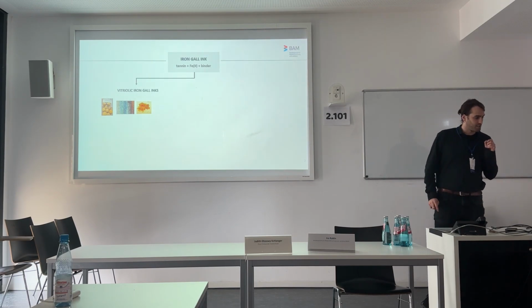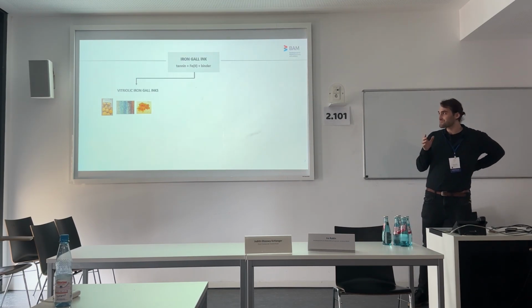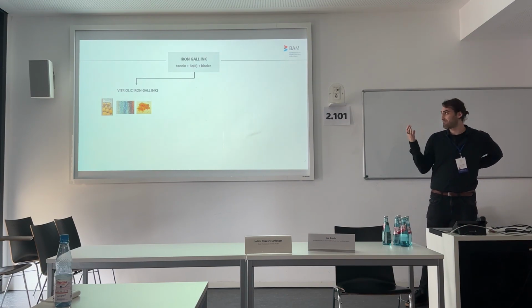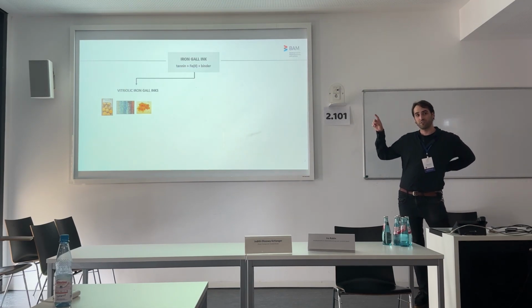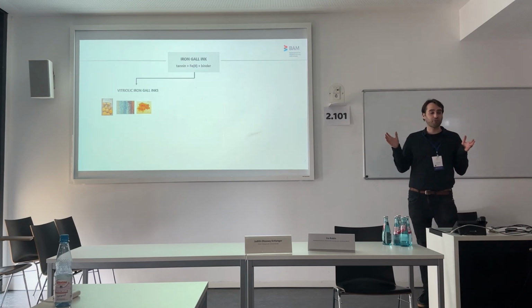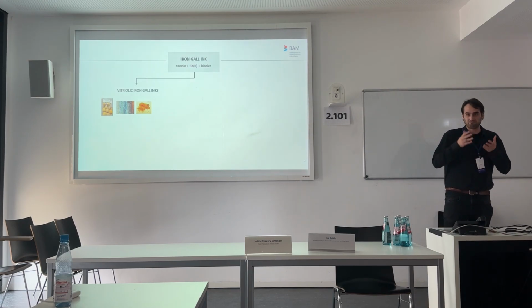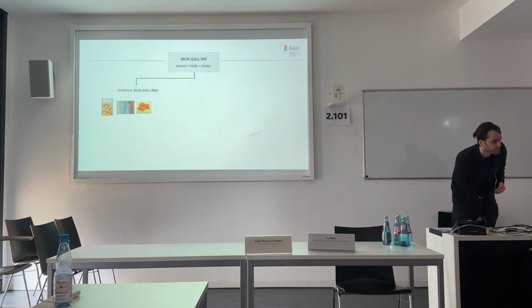As we can see in this little photograph in the middle between the three photographs, we see a picture from a mine where vitriol was collected. We see all those different colors, and all those different colors represent the different metal sulfates which are present in such a vitriol. Comparison of such inks is therefore rather simple when we look at the elemental makeup of such an ink, because they differ based on those vitriols used.